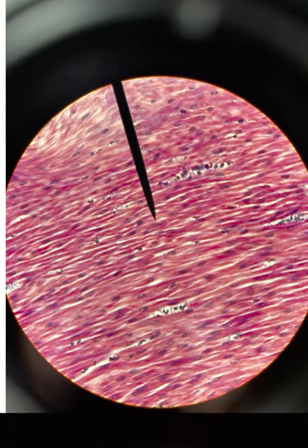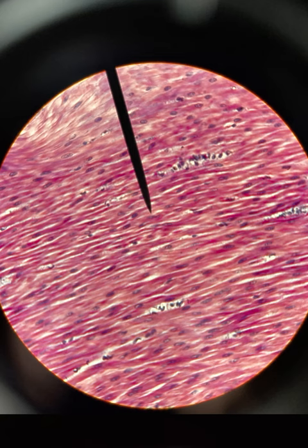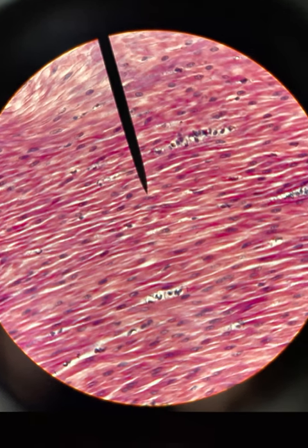Okay, and now we're into muscle tissue. So this is smooth muscle tissue, and a big tell for this being smooth muscle tissue is that it has this spindly, also starts with an S, appearance. It looks like a spindle, and you'll start to see that more the more that you look at it and as we compare it to other tissues. It also has no striations, and we're going to look and see what that means in just a second.